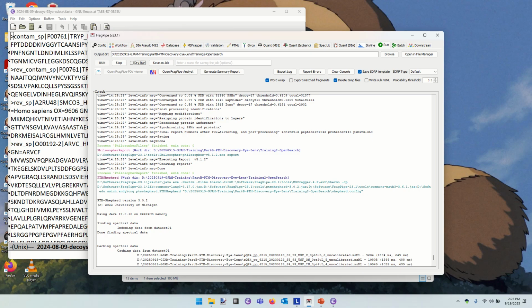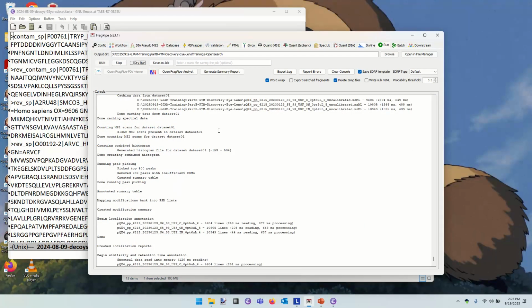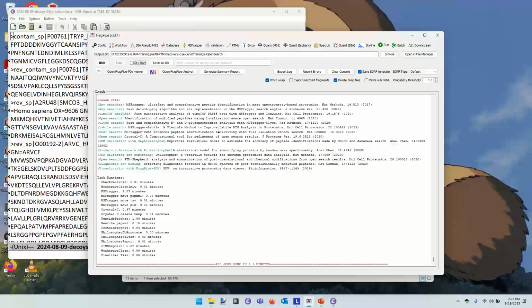What about the replacement of one amino acid for another? What if I had a proline but I saw that it had a mass shift of 16 on it. Proline has a mass of 97. A mass shift of 16 then would cause its mass to become 97 plus 16. It's after lunch. We're all struggling. 113. Yes. So proline, if you add 16 mass units to it, is 113.